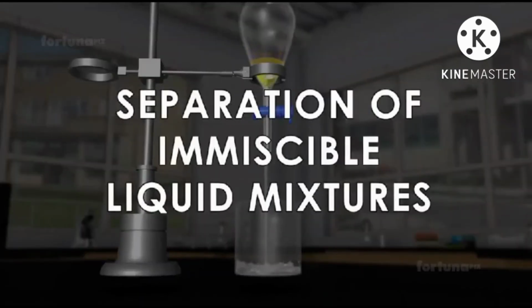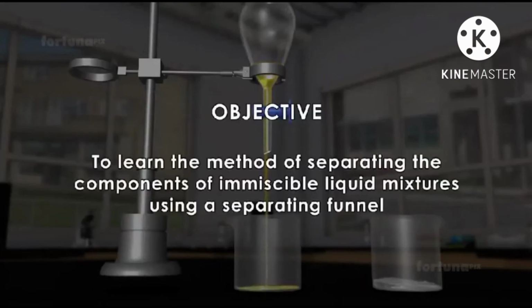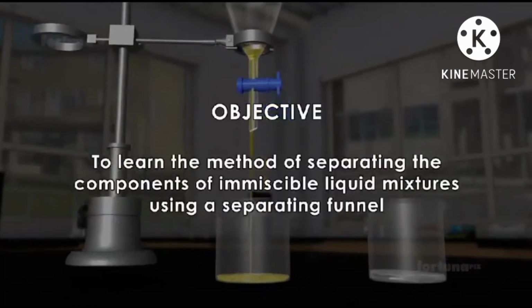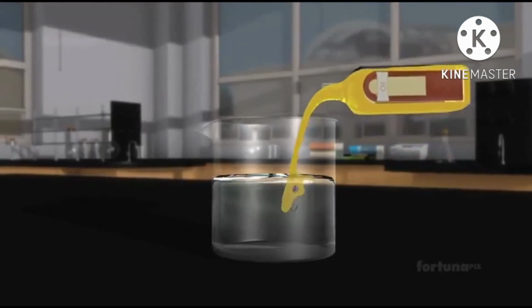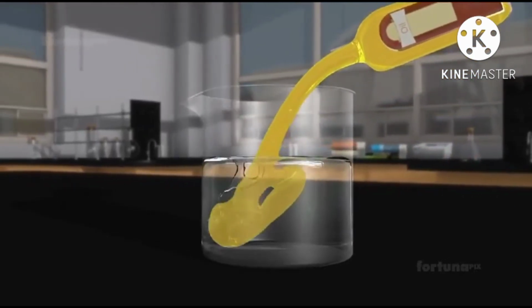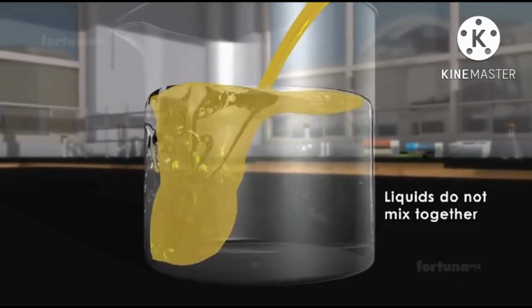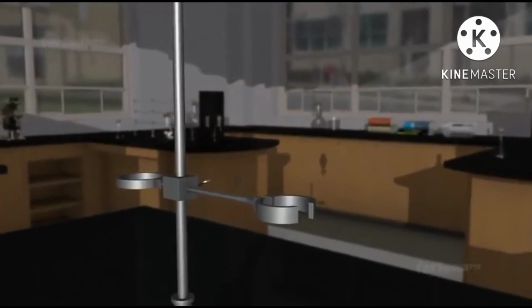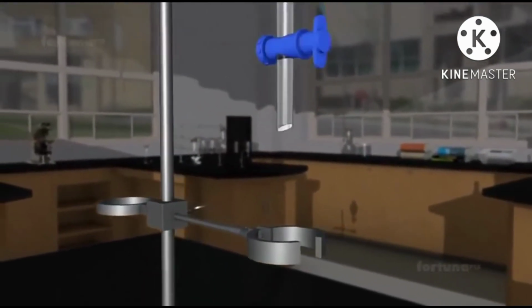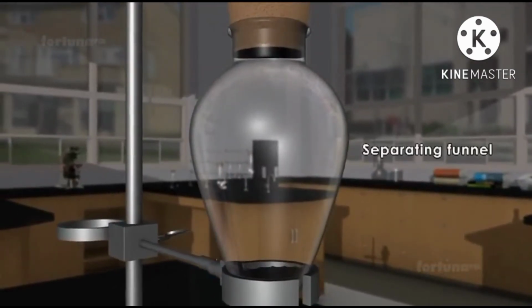Separation of immiscible liquid mixtures. Objective: to learn the method of separating the components of immiscible liquid mixtures using a separating funnel. Mixtures of liquids can differ based on how easily they blend together. When liquids do not mix together to form a homogeneous mixture, we say they are immiscible. A mixture of immiscible liquids can be separated using special laboratory equipment called a separating funnel.